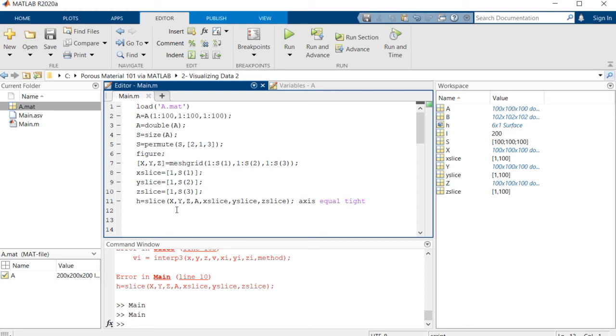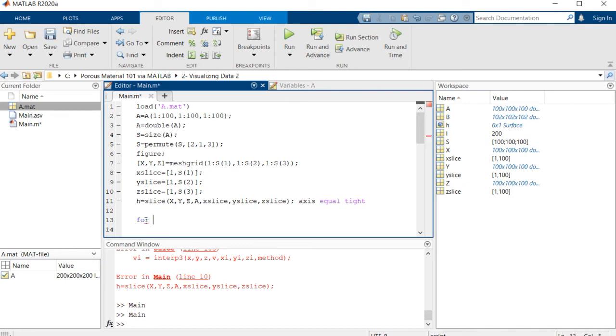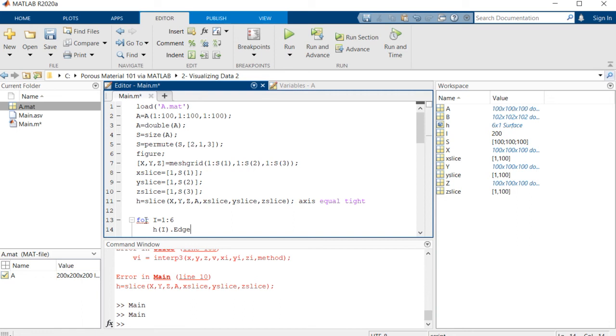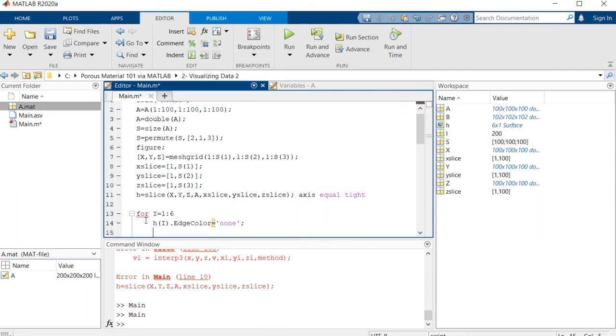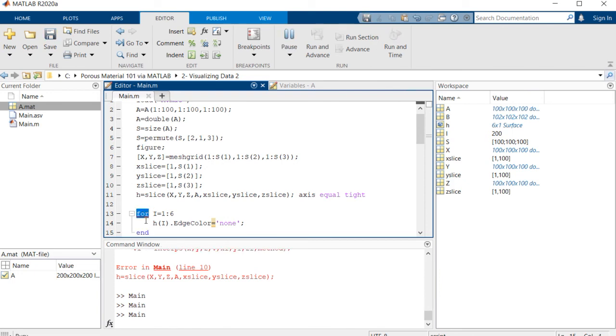And because we have saved this array, this image, inside this h handle, in order to do that for i equal to one to six, we need to go to h i, that edge color, and put it as none, and end.